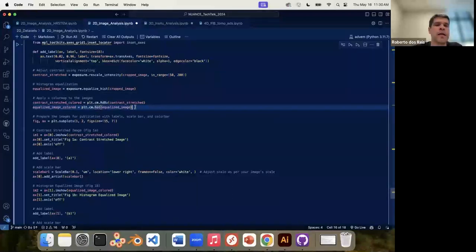If perhaps you have some sort of electric field and you want to plot it as a vector, for example, you might want a cyclic color map that goes with the color wheel. If you want to do directionality on a sample, depending on the contrast, you might want to use that as well. More like a cyclic color map.